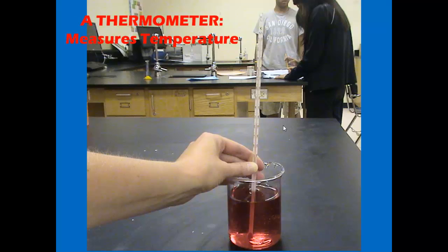When measuring temperature, we use a thermometer. Let's zoom in and see if we can find the temperature of this liquid. First, we notice the numbers. We have a value of 20 degrees Celsius and a little bit higher up is 30 degrees Celsius. The red on the thermometer lies midway between. Looking more carefully, we can determine that each of these lines represents 1 degree Celsius. That means we've gotten ourselves to approximately 25 degrees Celsius. But remember, we have to estimate the last digit. It looks to me like the red has just passed the 25 mark, just by a hair. So a good value for this temperature would be 25.1 degrees Celsius. The 25 was known with certainty. The last digit was estimated by us.